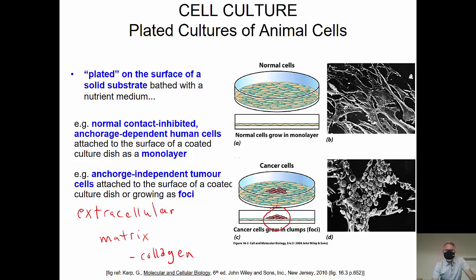And in this example, because it's just part of the plate that has this sort of clumped up, we can call that a foci. A foci is just an area where things are concentrated. Okay?